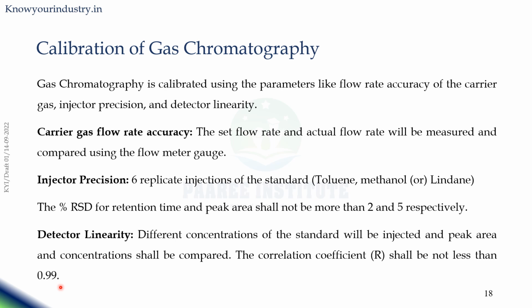So these are the few parameters which we need to calibrate from time to time for the gas chromatography to get accurate results for the testing, and to make sure that the instrument is working properly before or during the analysis.